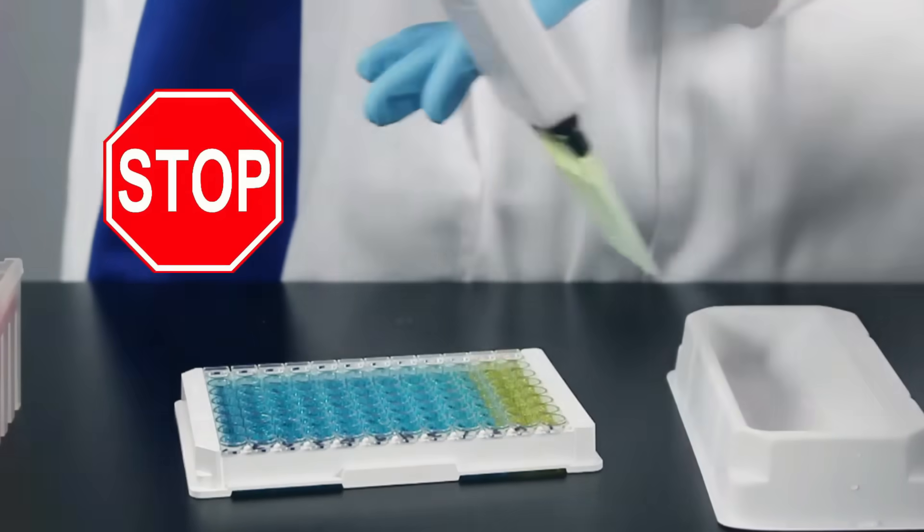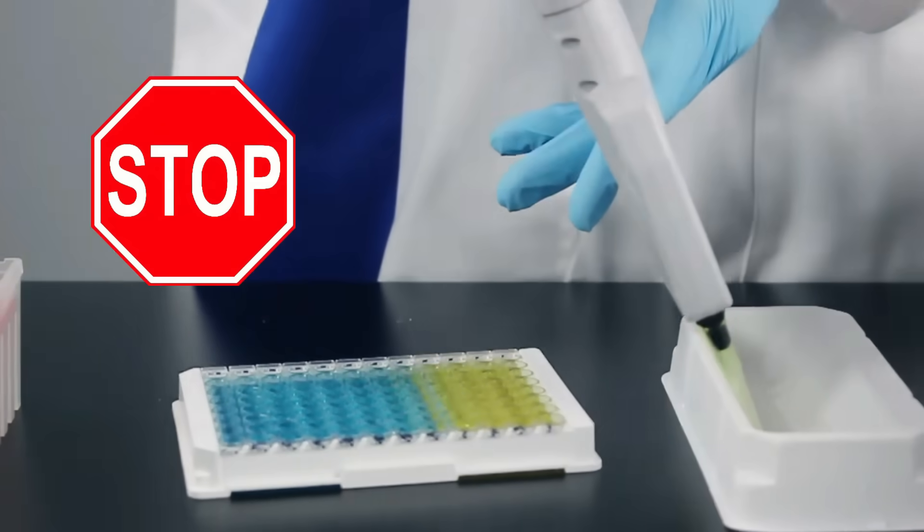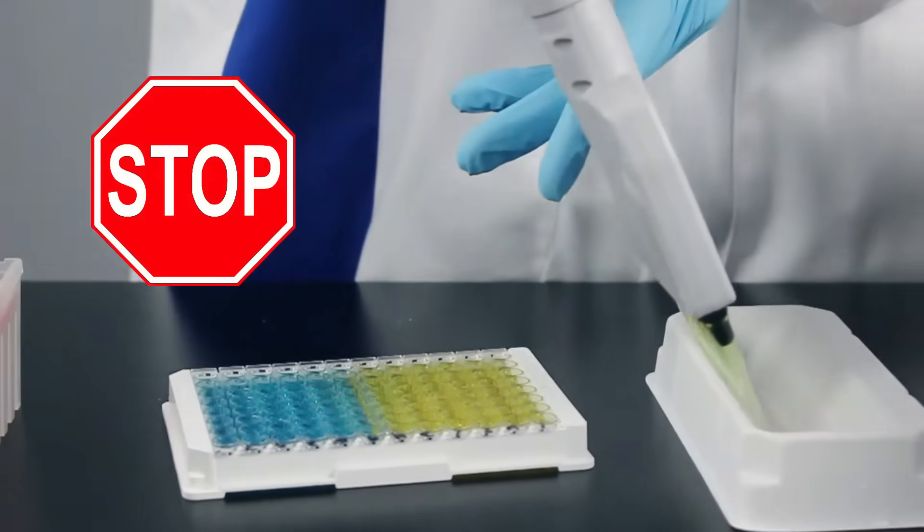To stop the reaction, we add stop solution, which is dilute sulfuric acid. These kits have been featured in over 4,000 publications and come with our risk-free guarantee.